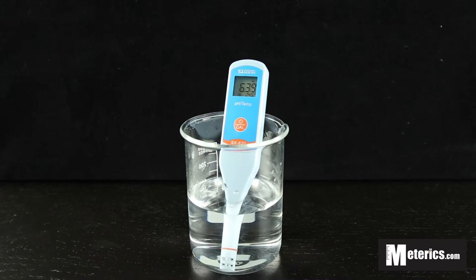And as you can see right now, we're at about 6.39. So it's stabilized and you're ready to take your readings.